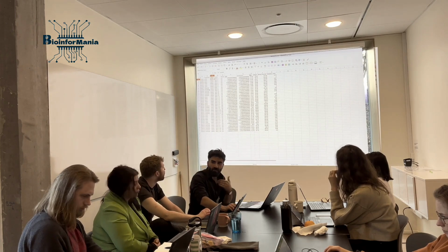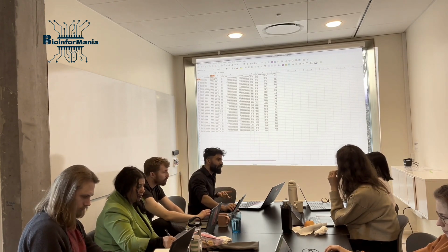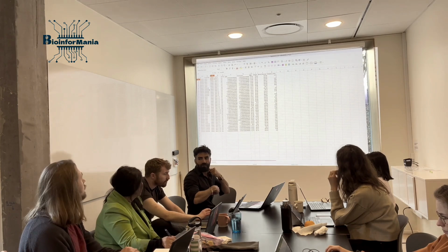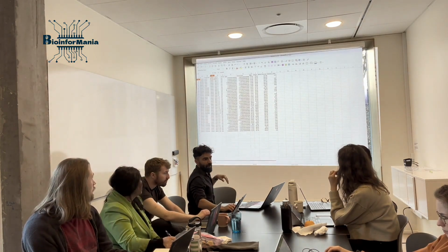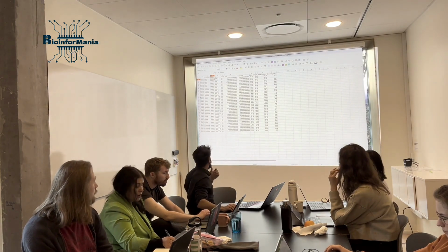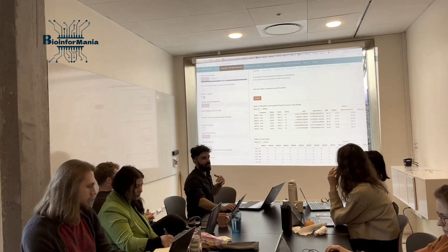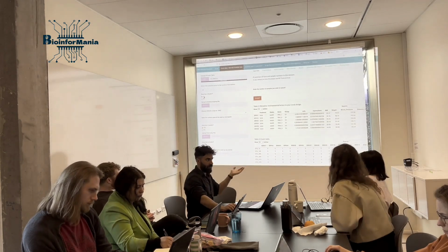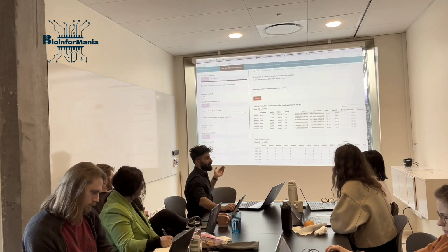Okay, we need to know about the design of the experiment, because obviously some variance might come from the week itself, which later on I will show you how to factor out, or put into the random error, something that you can reduce. There is a checkbox here: data has a header. Our data has a header, which usually it should have, and yes. If it doesn't have a header, you should set it as no, okay?